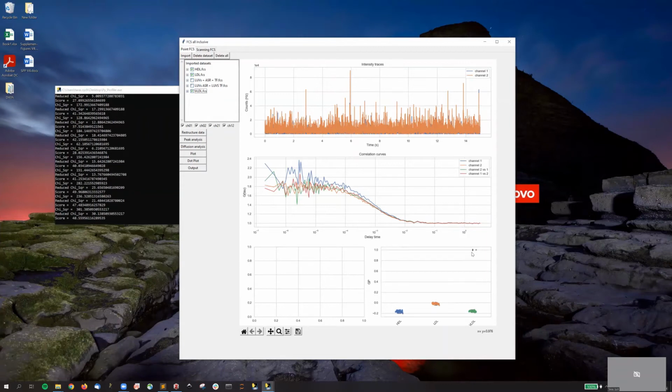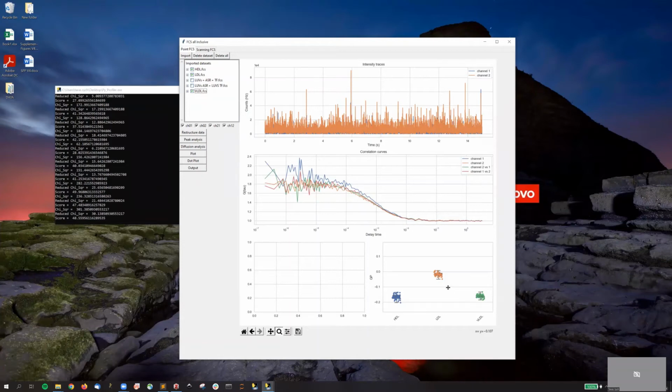So there is one outlier over here. And if you look a little bit closer, you'll be able to see that in 3 types of lipoproteins, we have different membrane order. The second parameter that we can extract from this analysis is, of course, the diffusion in solution.